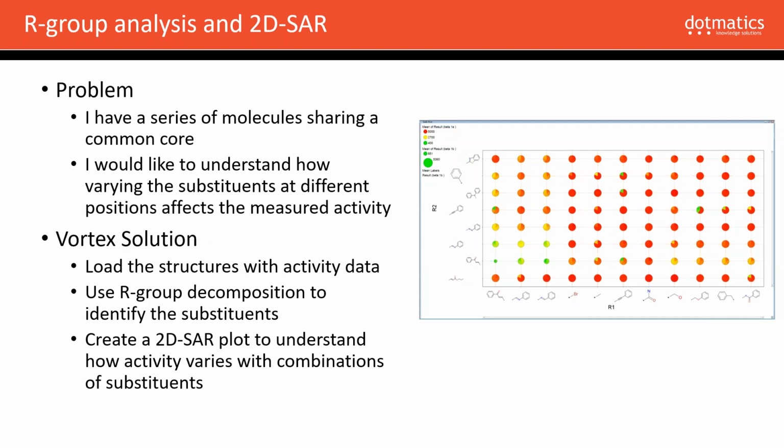This is an example where there were several R group positions, more than 2, but what we've plotted here is R1 versus R2 substructures. So we have a range of activities depending on what the R3s and R4s are, but what we're looking for are those with high activities irrespective of what the 3s and 4s are. So pie charts with more green in this case. Okay, so let's see that one live.